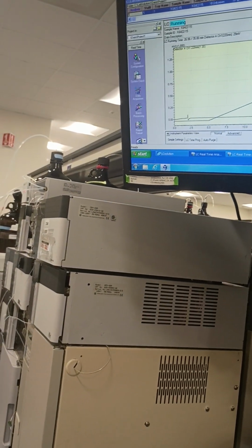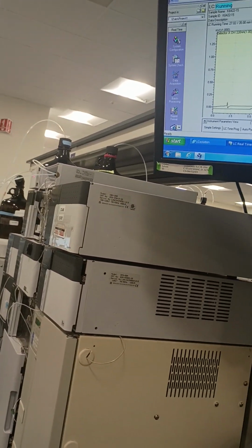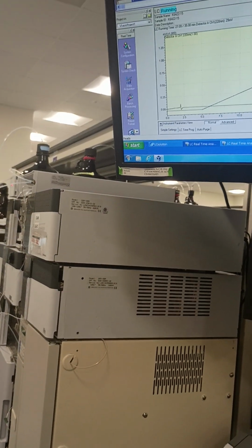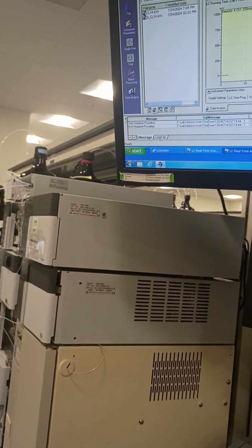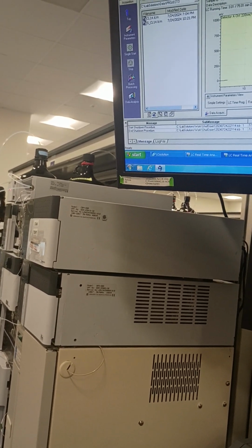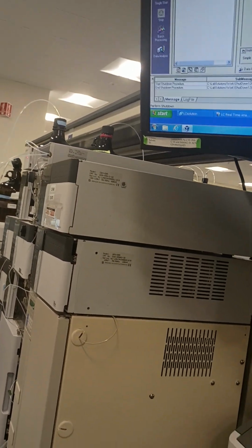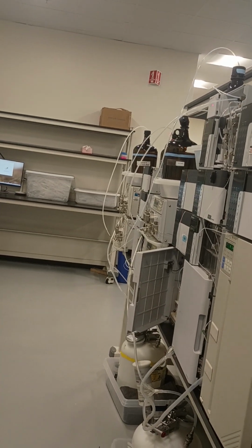So the only screen you're going to have, because we always leave this on this page, is like when it's off. In this case, this one is running, which is the analytical. The one we just shut off is this one. The page is always going to look like this, ready, but it's off because we shut it down. And that's the end of what we do.